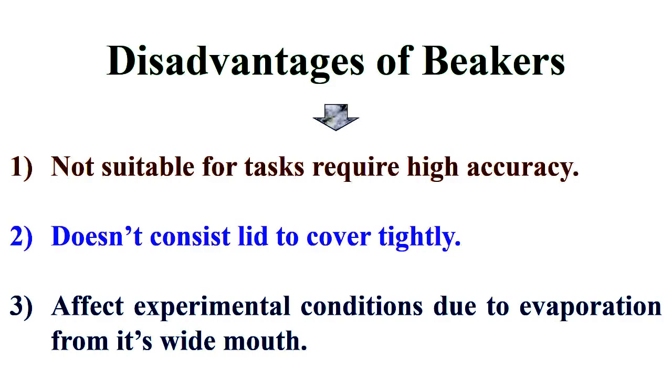On the other hand, beakers are not suitable for tasks that require high accuracy, and they don't have a lid to cover tightly, and this can affect experimental conditions due to evaporation from the wide mouth.